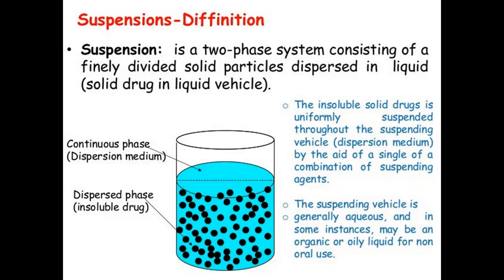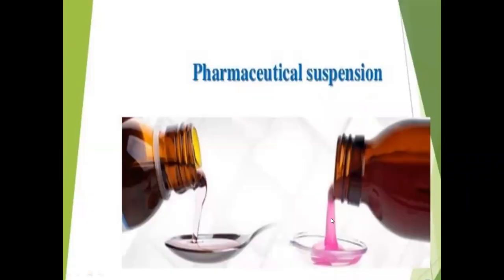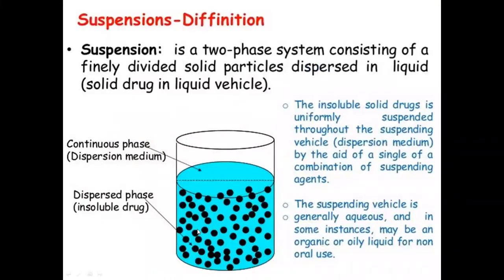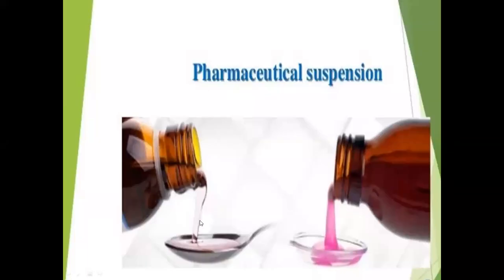समजले definition suspension ची? Yes, ma'am. And if there is insoluble particle, मग आपल्याला suspension म्हणजे कसं बनवायचंय? हे असं. Is it visible in your screen? Yes, ma'am. मग असं बनवायचं आहे. याच्यामधून लाईक दिस हे असे सॉलिडचे पार्टिकल्स येतील तर चालेल का? ते प्रॉपर इमल्शन असेल का? No, ma'am. We have to make like this.